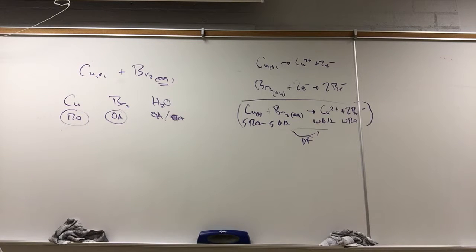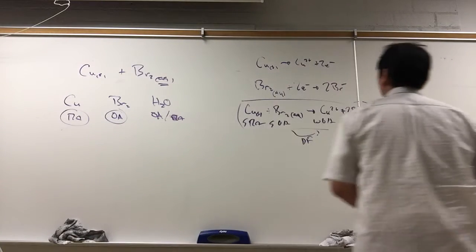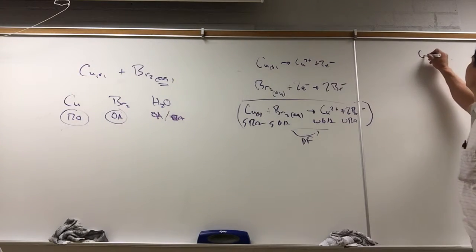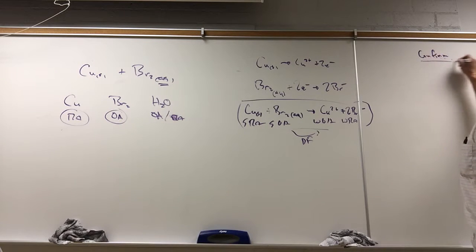For copper, we add 1 milliliter of 6 M NH3. Yes, good. And for bromide, actually, we add silver nitrate. Yeah. And so what we're going to do is confirmation of the products, taking advantage of their properties.